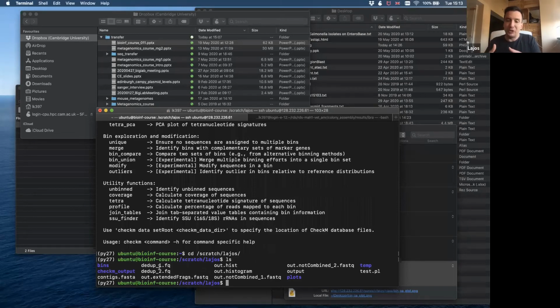usually we don't run CheckM on one assembly. You either run it on a metagenomics assembly where you have a lot of different files, or you are just getting back your multiple sequencing files, multiple isolate sequencing. It's very rare that you are sequencing just one colony at a time. You're usually doing more than one. And if you have all those contig-FASTA files out of the de novo assembly, you can just put them into one directory and do the whole CheckM process on all of them with one command.